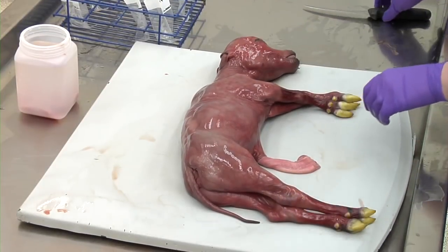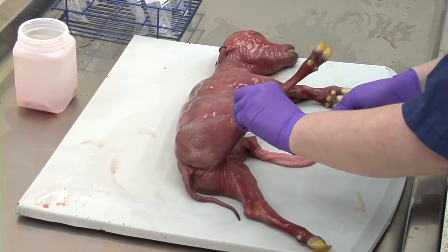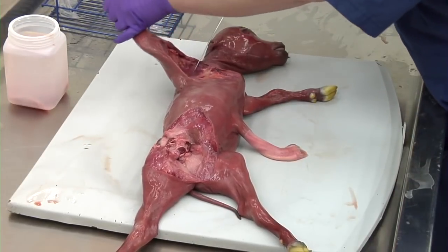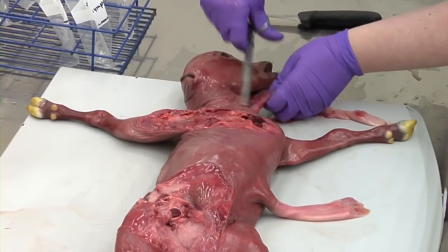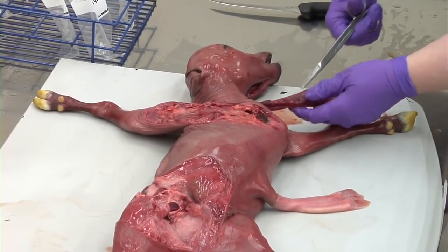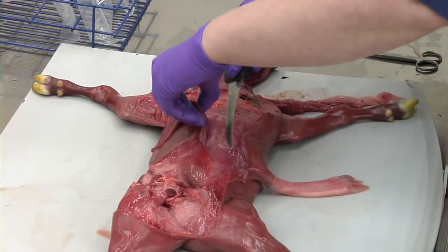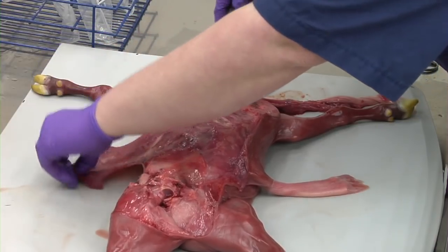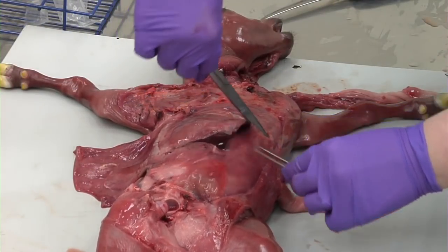The fetus should be necropsied as any other bovine in left lateral recumbency. Begin by completely reflecting the fore and hind limbs. The tongue, esophagus, and trachea should be removed to the level of the thoracic inlet. Next, make a ventral midline skin incision that extends to the thoracic inlet. Reflect dorsally the skin and subcutaneous tissues, then incise through the peritoneum into the abdominal cavity.